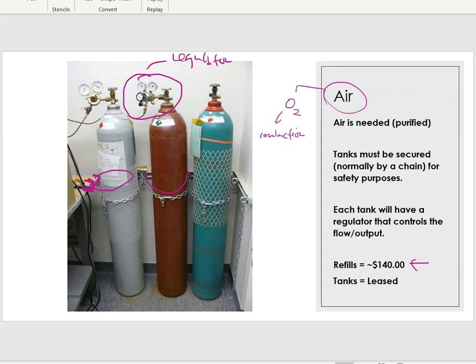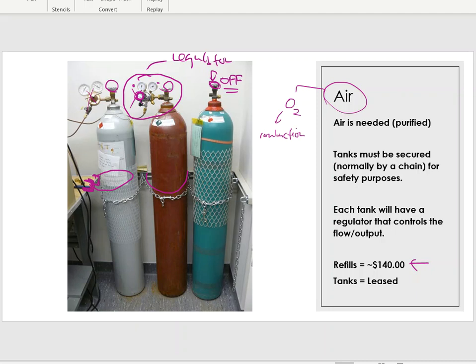On top of each tank you'll see a valve called a regulator, and the regulator serves two purposes. You'll notice two meters — one on the left and one on the right — and a control knob on the front. If you're not using the TOC, make sure you turn the tank off at the main nozzle valve, not the front regulator knobs, which serve a different purpose entirely.